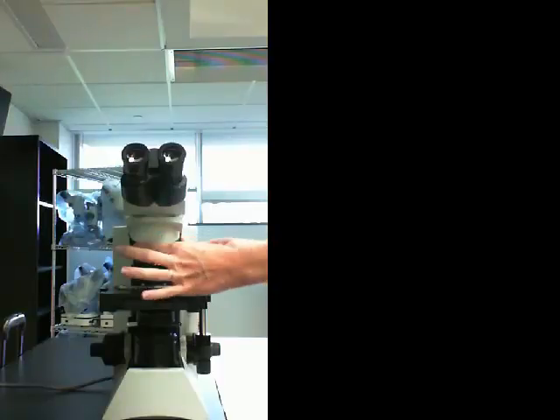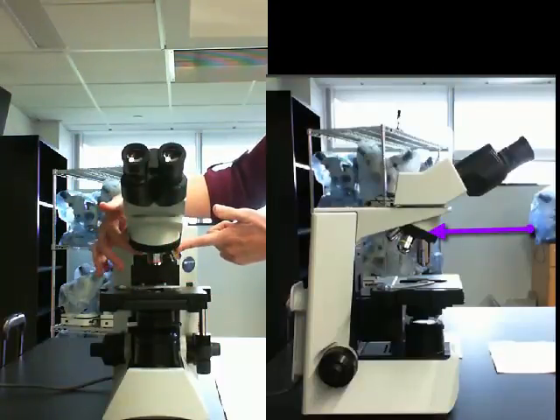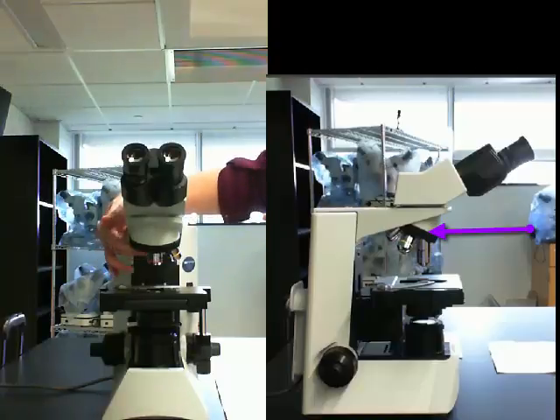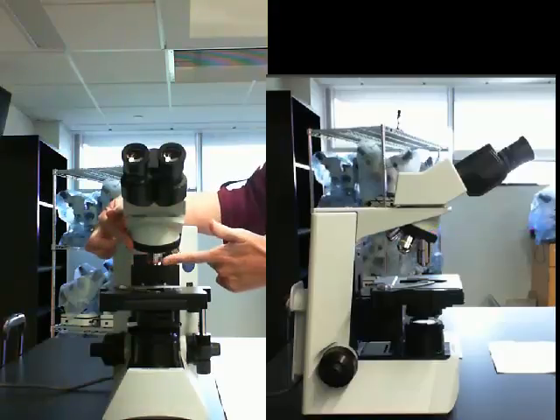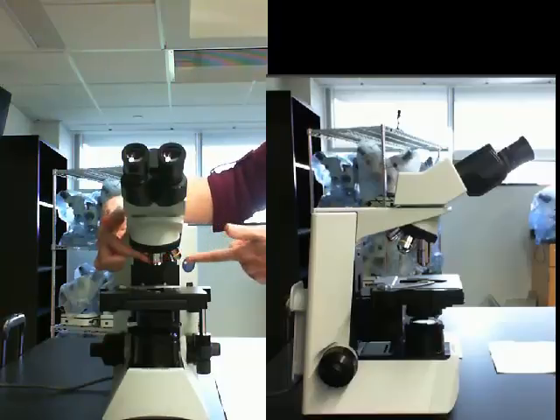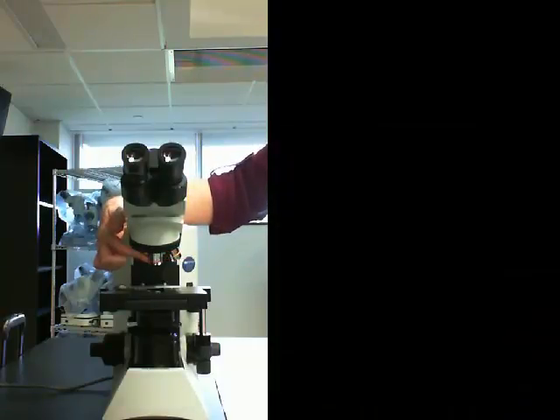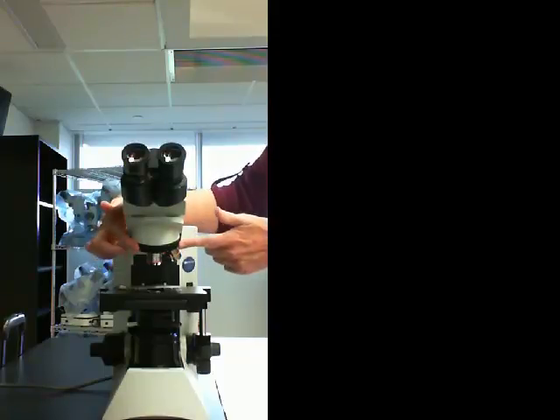Then we have our nose piece, which is this piece of the microscope right here, and it is holding our objective lenses. There are typically 4 lenses on a compound scope. Yours will only have 3. We start off with the one with the red ring. This objective is a 4x objective, also known as your scanning lens, and this is allowing you to get a wide view of your slide to be able to find your specimen and get a coarse focus on your specimen.